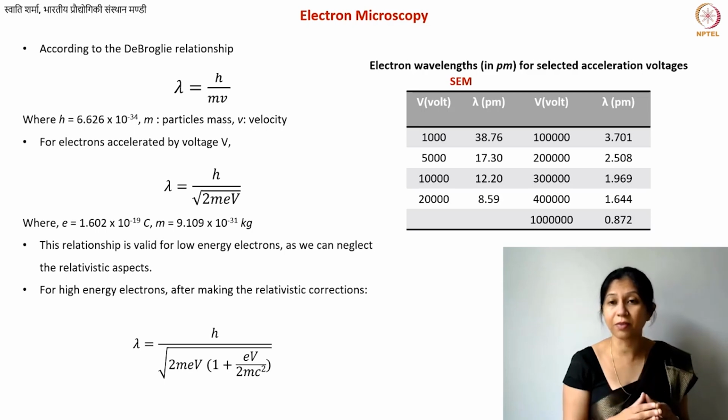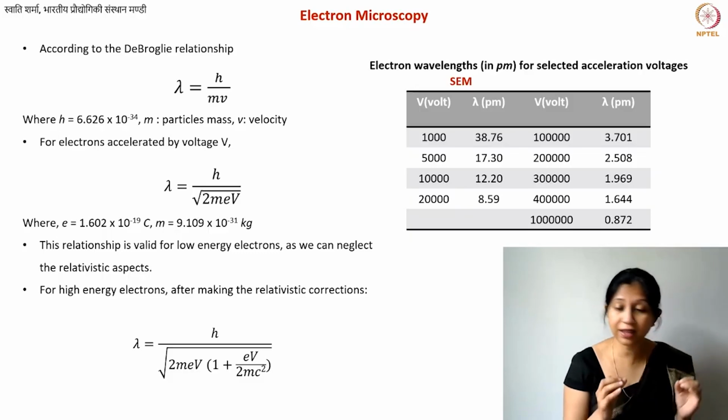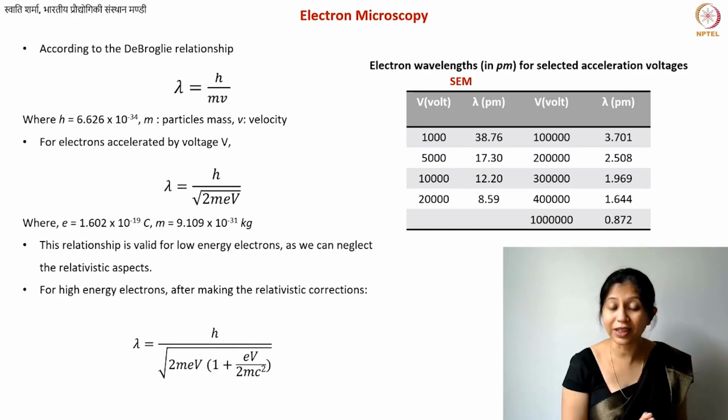So that is what we know as transmission. And for transmission electron microscopy, the wavelengths in the second column of this table are the ones that are used. Now, from what do you see here? The wavelengths associated with electrons are in the picometer range. So they are much shorter than even your X-rays. If you remember in the X-ray diffraction lecture, I said that the wavelength should be pretty much of the same size as the interatomic distances, and that is why we use X-rays for diffraction purposes.